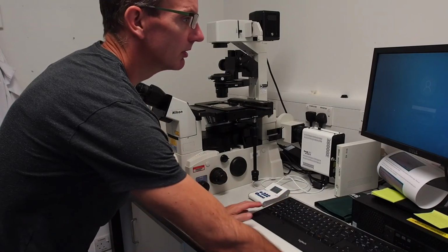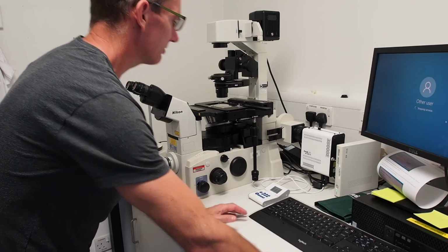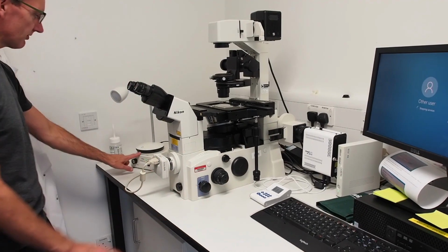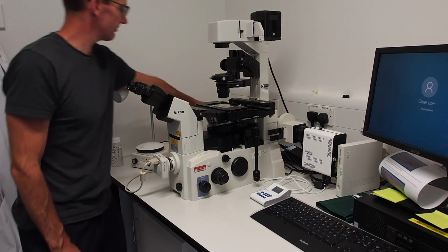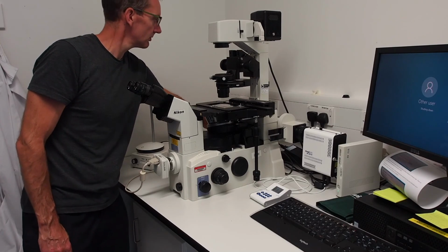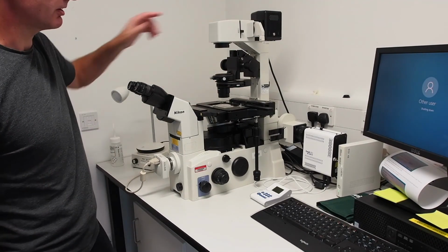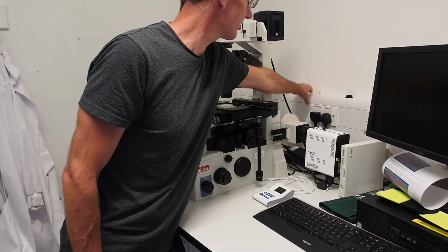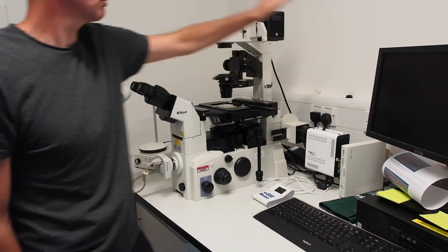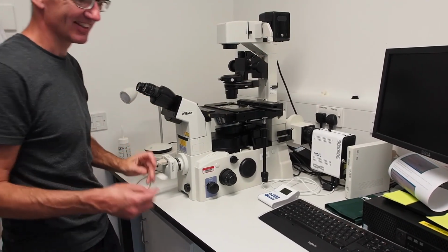If there is no one booked immediately after your booking, switch off the PC within Windows, then turn off the microscope at the gang plug and at the wall. Once the computer has powered off, turn the PC and the monitor off at the wall. And finally remove your samples from the microscope.